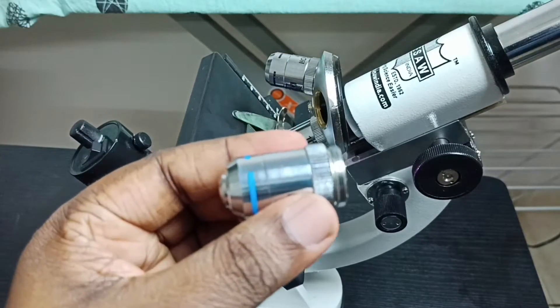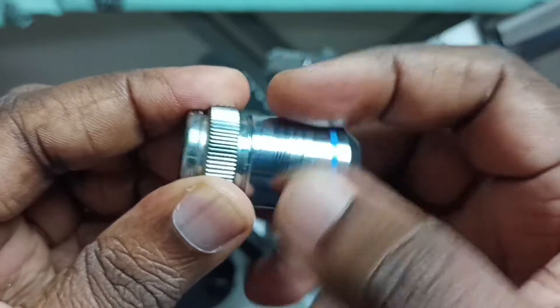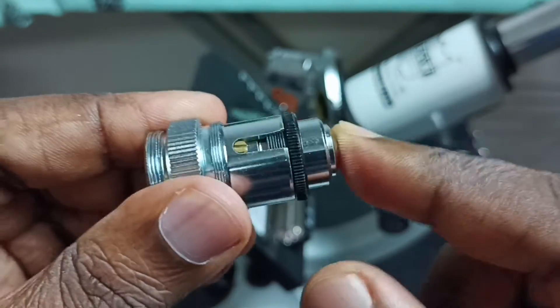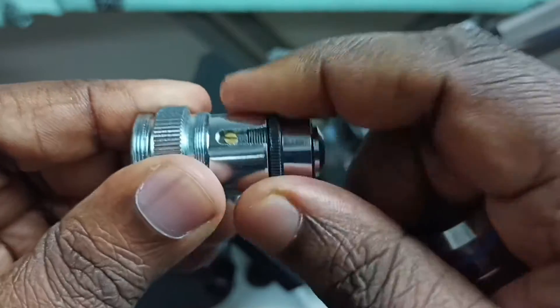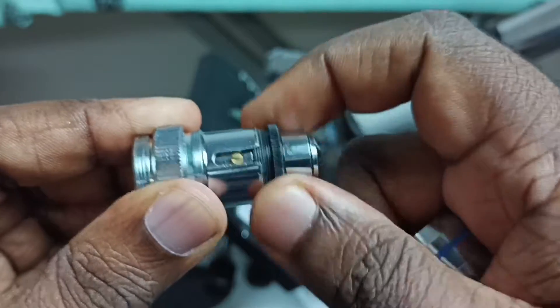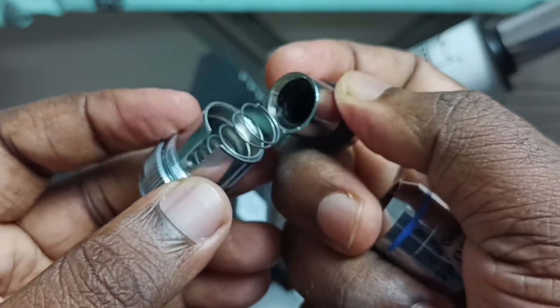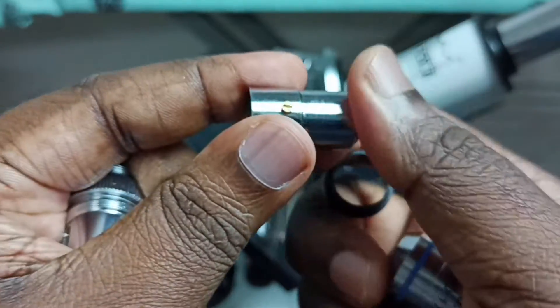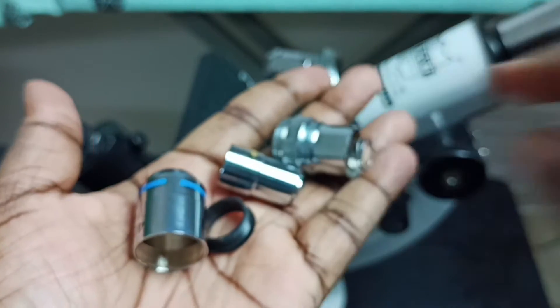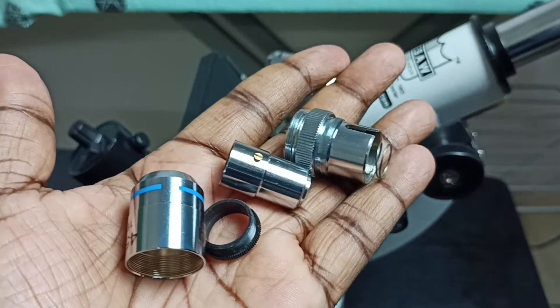Okay, done. See, this is the lens — let me open this. There is a spring inside, let me remove this plastic. So these are the parts, and this is the lens.